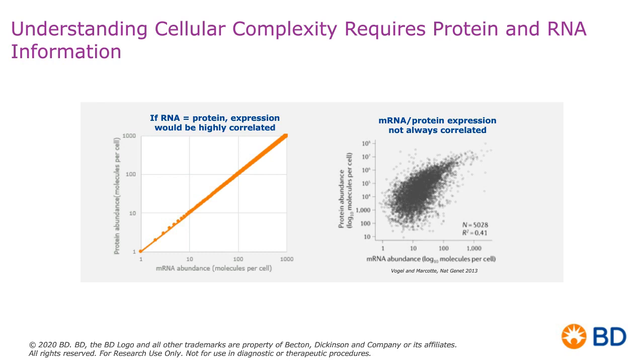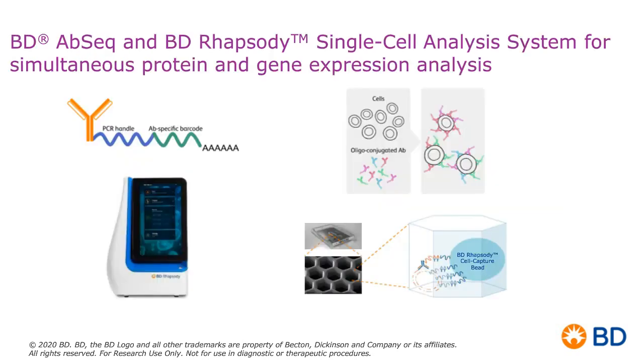So that's where the BD AbSeq and BD Rhapsody single-cell analysis system really comes into play for the simultaneous protein and gene expression analysis. Now, I won't go into this technology too in-depth because on the BD Biosciences website, there's countless webinars out there that really highlight exactly how this technology works. But I'll give you the 50,000-foot view.